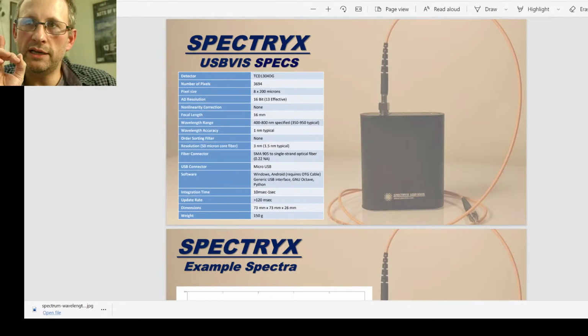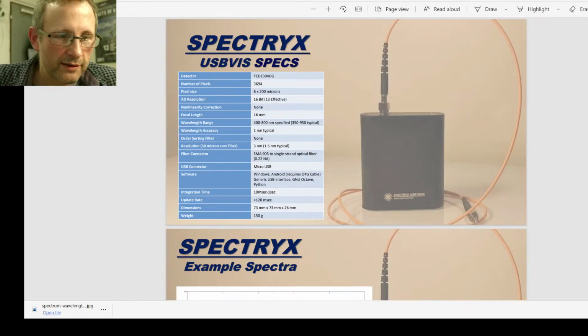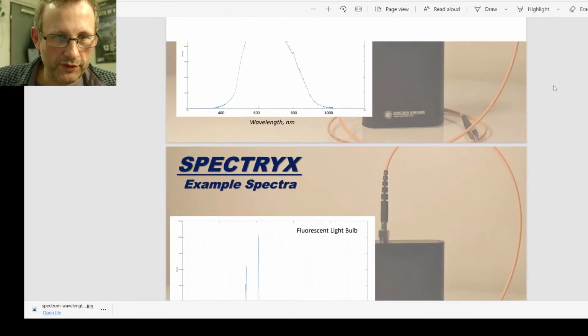What I'm going to show you in a minute is I've set it to 120 milliseconds because the intensity of the light is much lower, and so I have to sample for longer to get a smoother waveform. Okay, so that's that, and the reality is that I will probably do what they've done here.